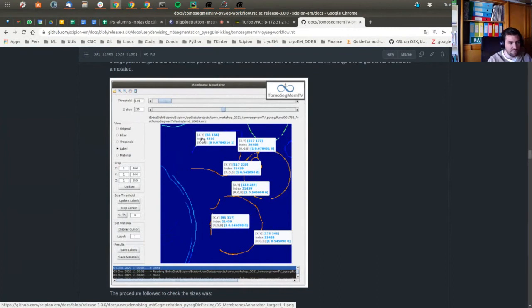So different values mean different structures. But if we know that different structures are for real the same structure, we can annotate them with the same index. The problem, for example, could be with a very low value of the threshold, and this could be automatically detected as the same structure. This way, we couldn't be able to separate them, annotate them as separated structures.